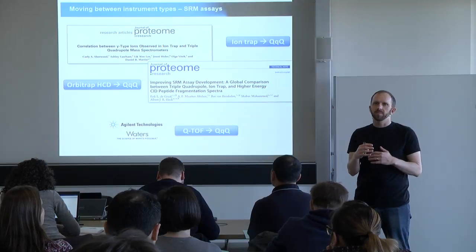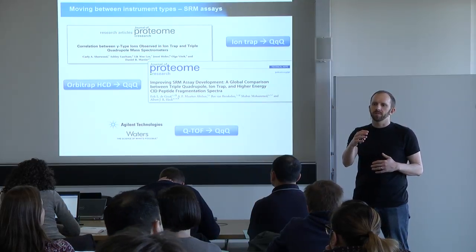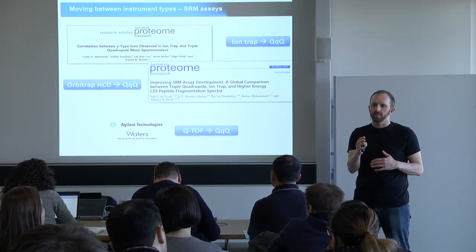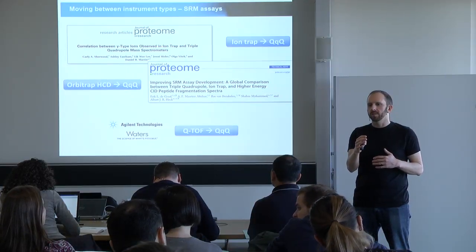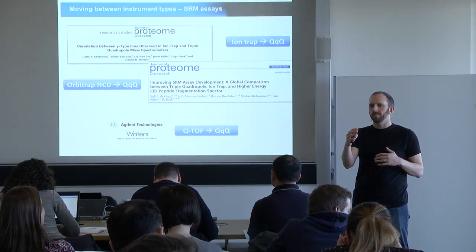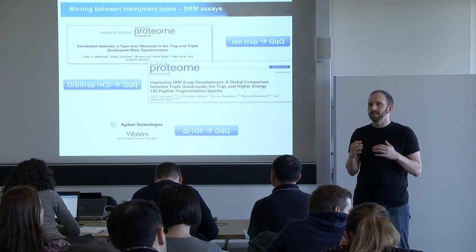When you use multiple engines, do you go for the overlap, or do you take the total? What we do actually is first we analyze each search engine with this peptide prophet tool from the TPP, and what this does is put all the scores onto a common framework, which is this peptide probability score, a real probability, and this allows you to combine them in a statistically meaningful way.